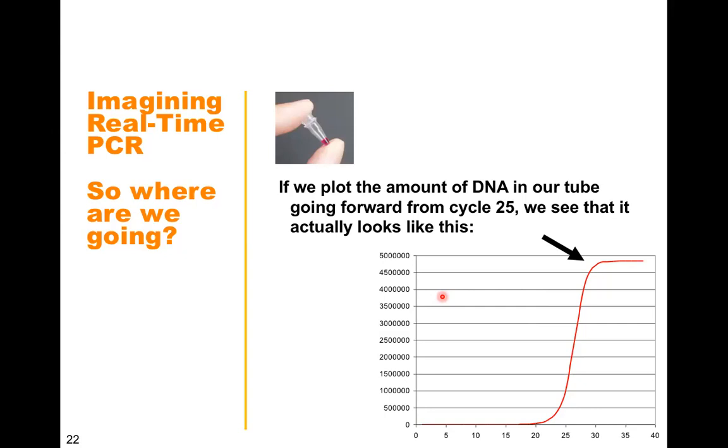There is a saturation, because we put everything at a particular concentration. We put primers, we put nucleotides, and everything has a specific concentration. The purpose of putting specific concentration is that the reaction should not get saturated, and we should just have 20 lakh or 40 lakhs molecules for the detection. That much is enough for us.